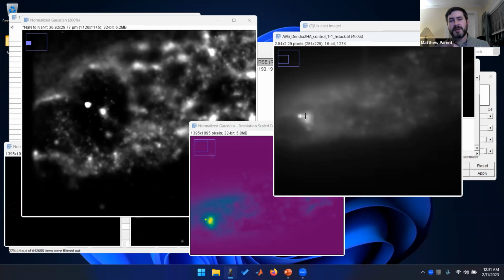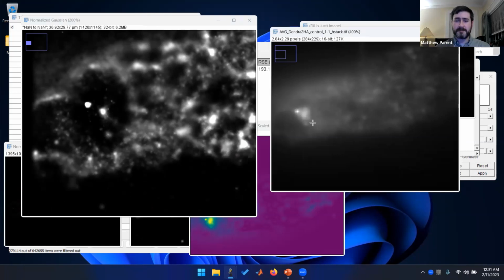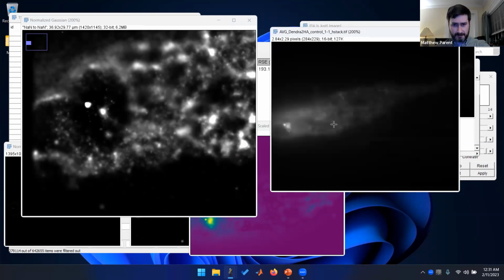Probably when I was imaging, too many point spread functions were all on top of each other, all overlapping in the same place. I either had to filter them out to get rid of artifacting, or it just didn't pick them up as point spread functions, so there was nothing there to fit.